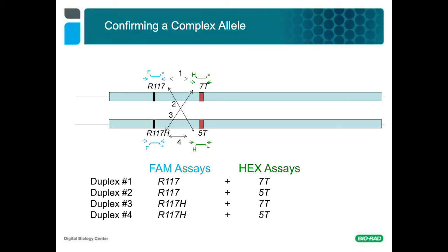These 4 duplexes together can be used to conclusively determine the arrangement of the variants. From a linkage standpoint, 2 of the duplexes should show a similar level of positive linkage, and the other 2 should effectively show no linkage. We utilized this approach on a cell line derived from a cystic fibrosis patient with these variants and found it to work extremely well. We decided to expand the project to demonstrate that we could phase different variants across the gene.